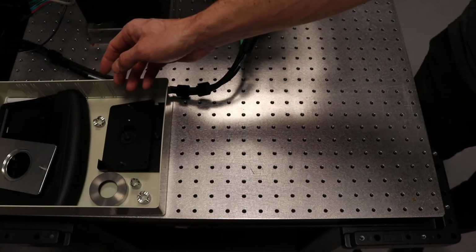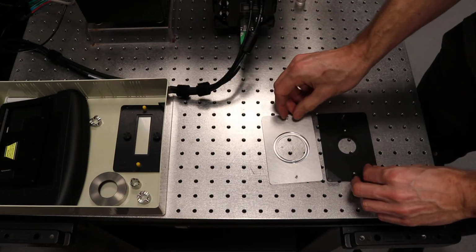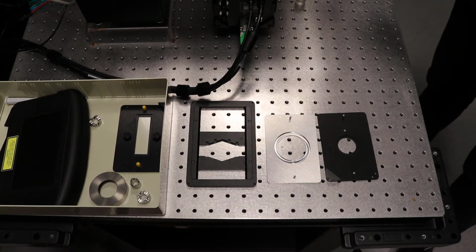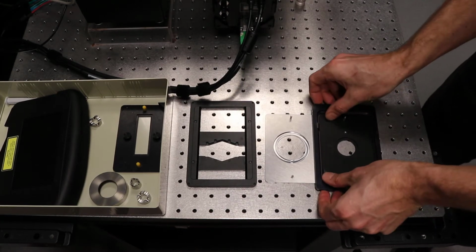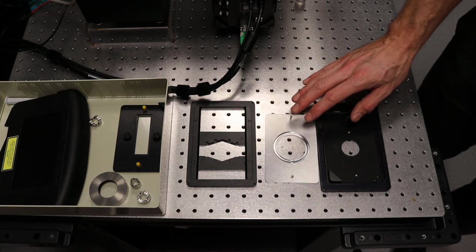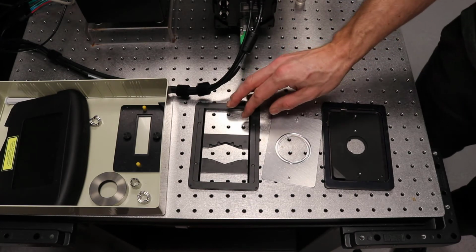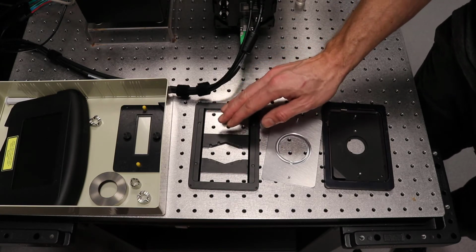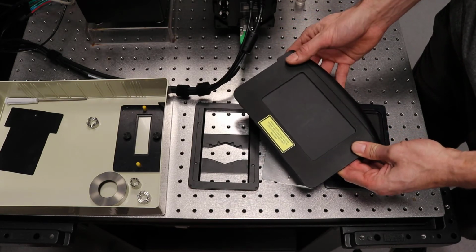Okay, for this system we have some parts in the box to the left, and I'll just outline them here. These are for Petri dishes, and if you need slides, you have this one. The Petri dishes need to be fixed inside this one, and the whole thing goes into the microscope. You need to know that we have 3 configurations. For Petri dishes, you start the configuration for plates, and for slides you start the configuration for slides, and then we also have a configuration for TIRF. Whenever you need TIRF, you use the slides, because that's what you need to set up. And also, whenever you need TIRF, you use the lasers, and then this cover needs to be on top for laser safety.